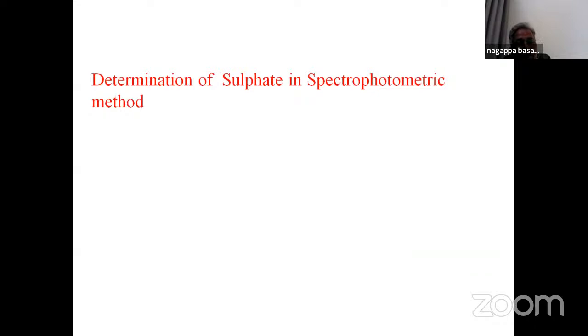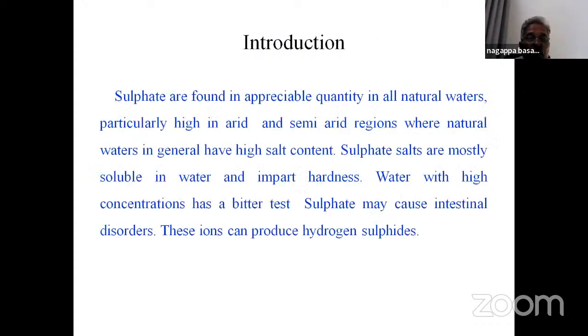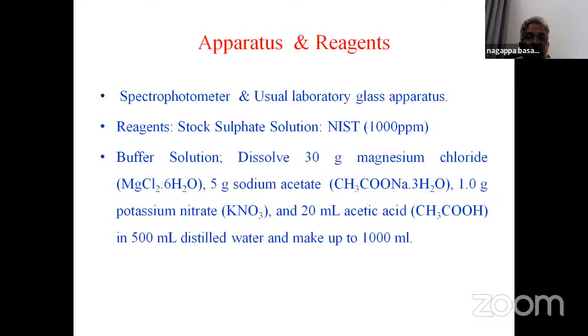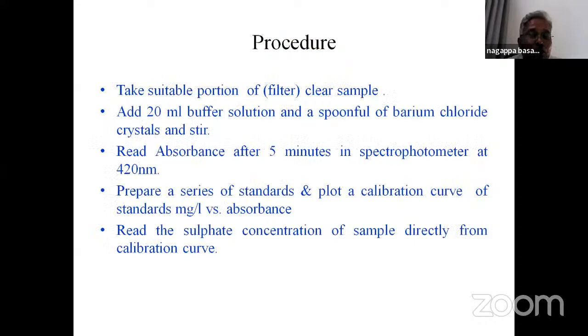Sulfate is also a very important parameter in water. For sulfate, you can use the APHA method; 4 methods are available. The first is the conditioning reagent method, the nephelometric method in APHA. Out of the 4 methods, the easy method, the nephelometric method, is very good.